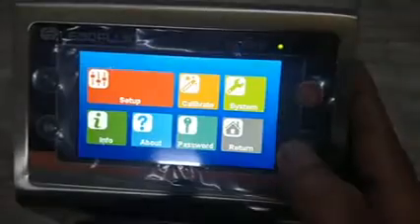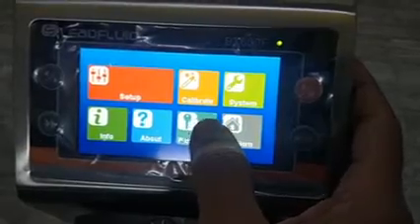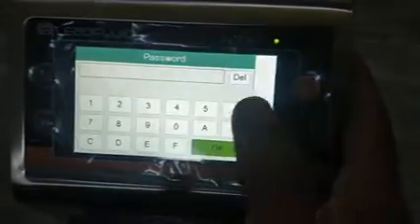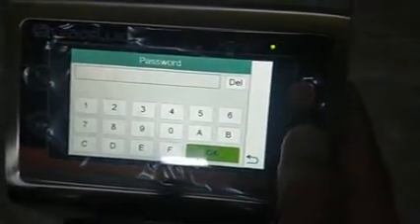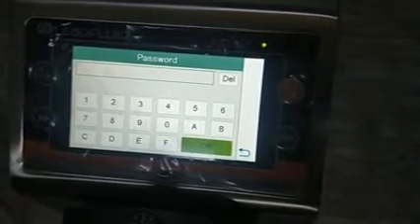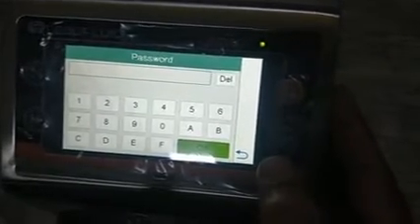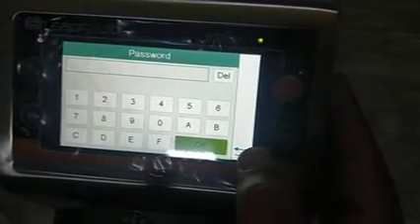You can also set a password, as we mentioned for locking the keypad. However, we suggest keeping it blank because sometimes passwords are forgotten and it becomes difficult to retrieve. Of course, if you want you can set a password.